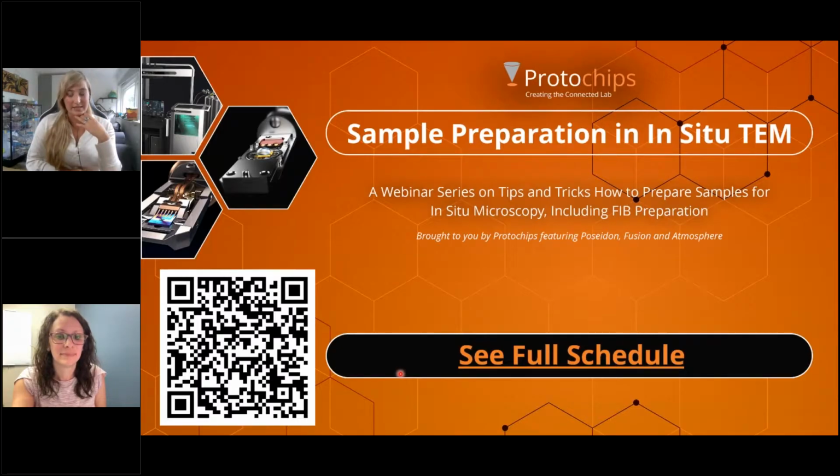Yeah, definitely. This is a very good question because obviously if you go to very high humidity, at some point you will get condensation, and this is not something that we would like to have in our cell, because if you have condensation, it's going to be extremely difficult to get that liquid out of the cell. So our systems are all designed to make sure that you don't go over the condensation limit with different temperatures and different pressures. This depends on the pressure that you want to use, but we all have this internally designed so that you never start condensating liquid in your system. In general, if you have a certain humidity outside, at some point it starts condensating. There's a general formula for that I could send through if necessary.